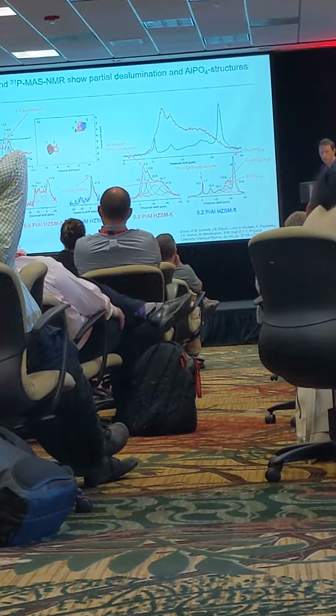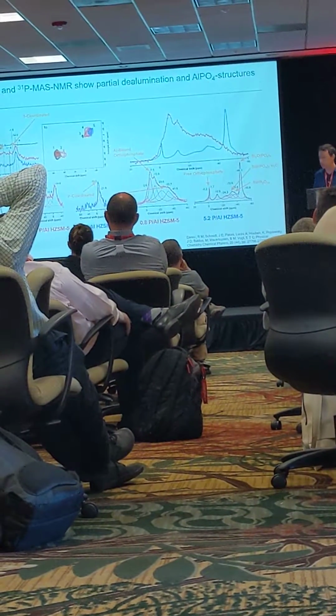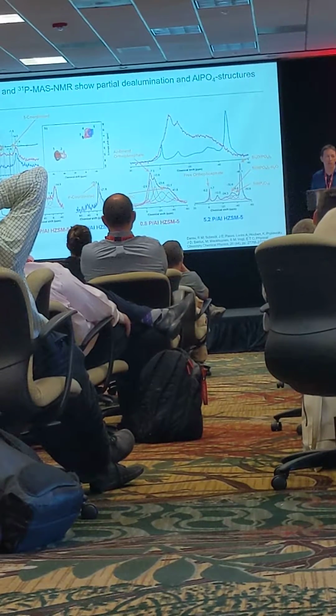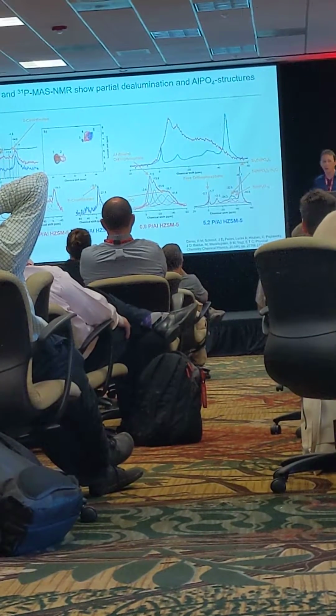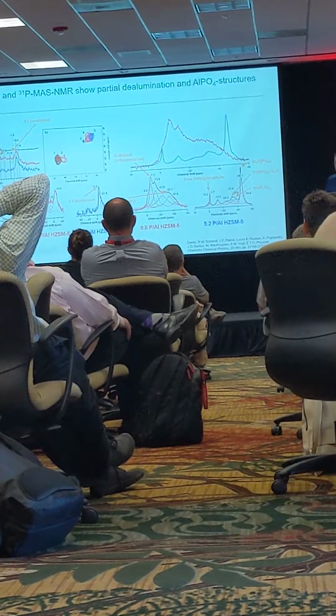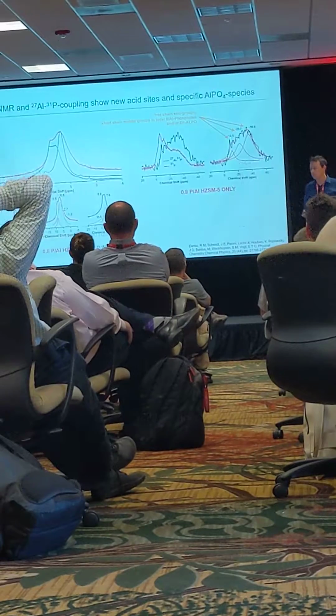And one thing here is now we've got a whole new set of species showing up. We've got these silicon phosphates. We've got a silicon orthophosphate, a silicon hydrogen phosphate monohydrate, and a silicon hydrogen tripolyphosphate. So very, very different materials showing up with that high phosphorus level.